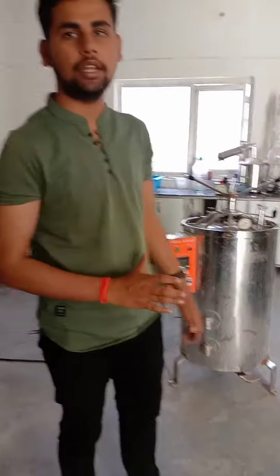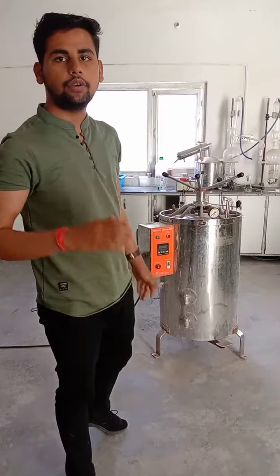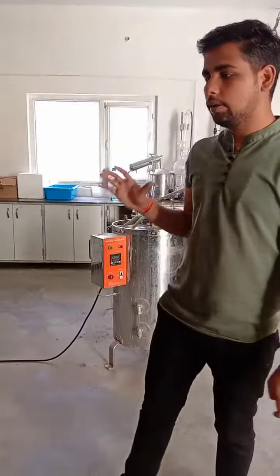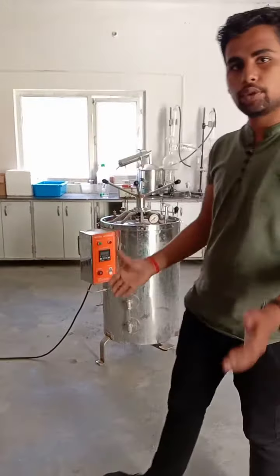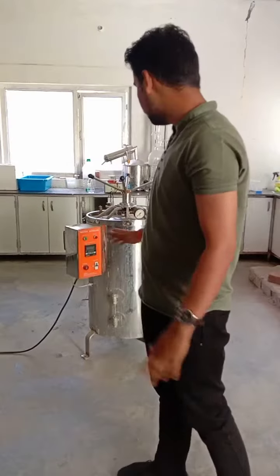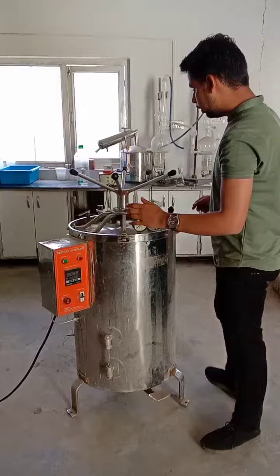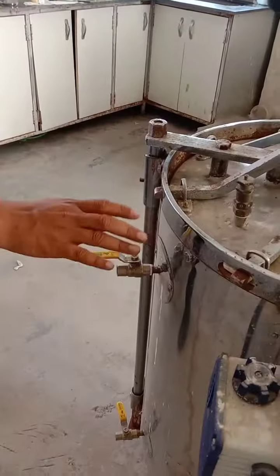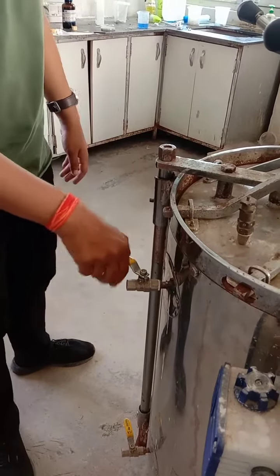So we have to discard them and we have to add a different auto-plate. We have to open it to 121 degrees Celsius and we have to keep it around 20 minutes. After that we will open it and we will keep it, and here we will be able to open it.